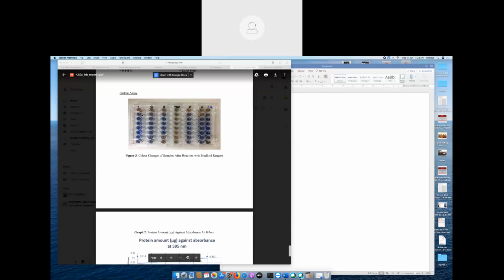Okay, maybe group 1, we focus on this side. It looks continuous. I mean, the intensity of the blue color is increasing.